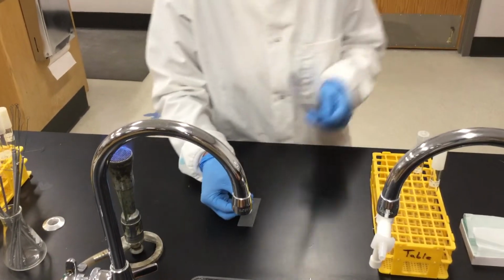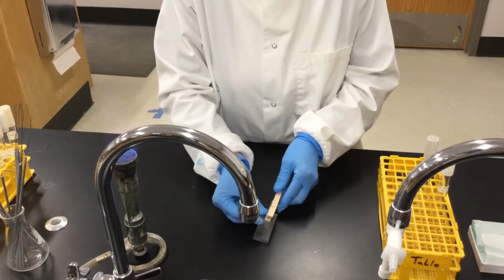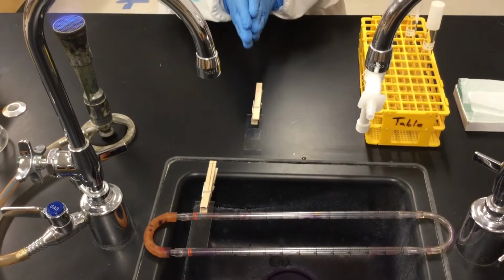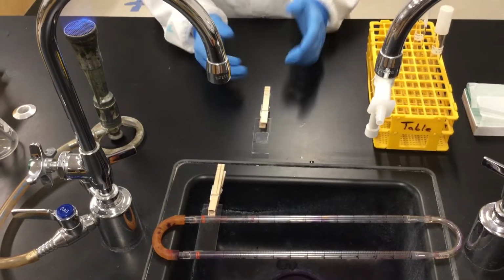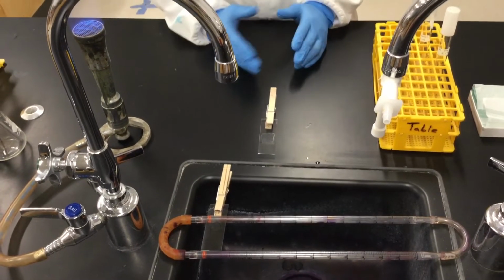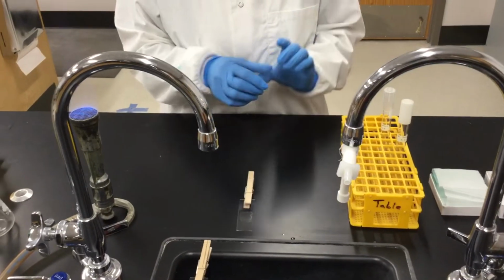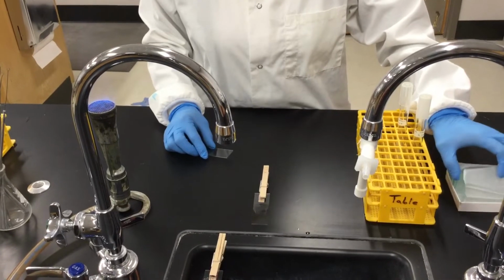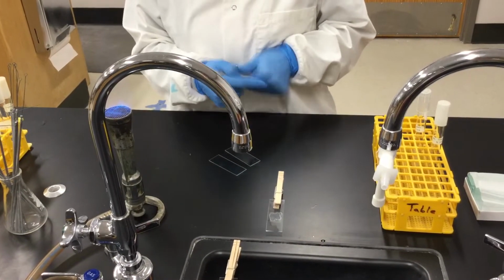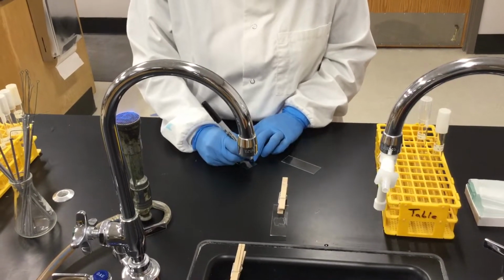Oops, wrong one. And then put it in there. So with this, I'm going to do a Gram stain, and I'm going to prepare another tube for doing methylene blue stain or simple staining. And then the other one that I'm going to do is for nigrosin stain or negative stain. I'm going to label them while I wait for that to dry.